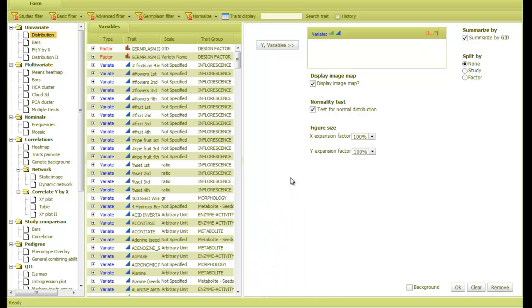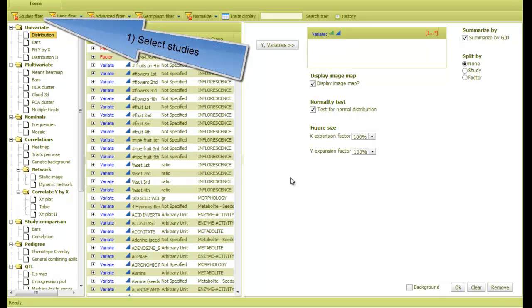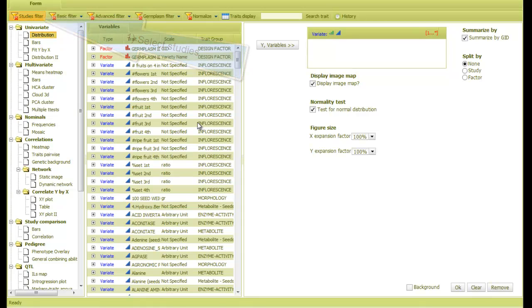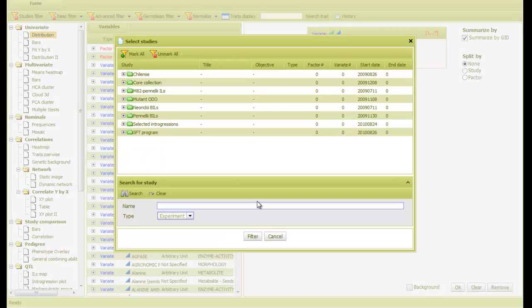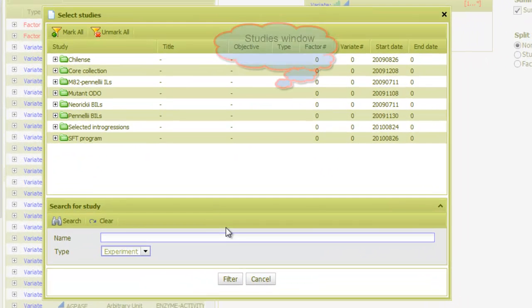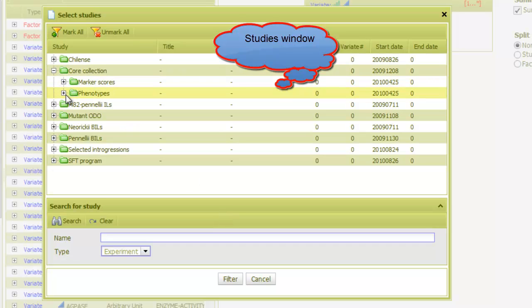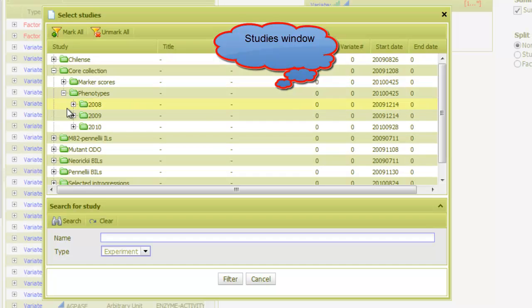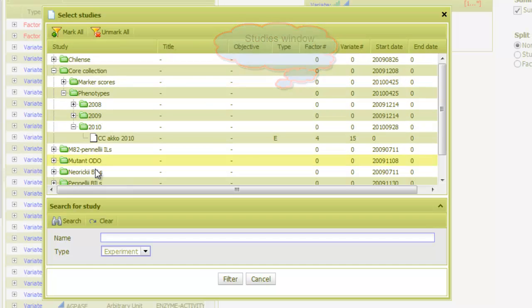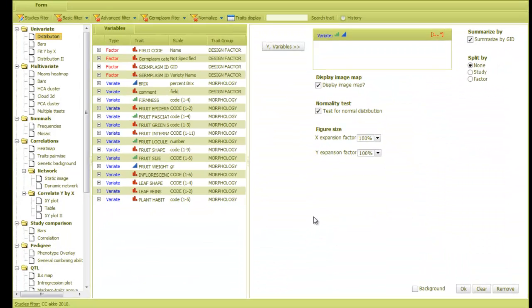Now, to perform an analysis, there are three simple steps to follow. The first is to select the studies or experiments that we want to focus on. For this, I click on the studies filter and the studies window appears. Then I select one or more studies. Let's pick this one.